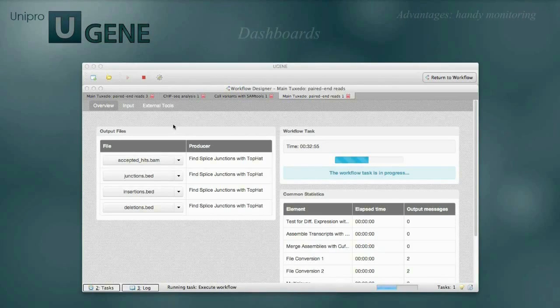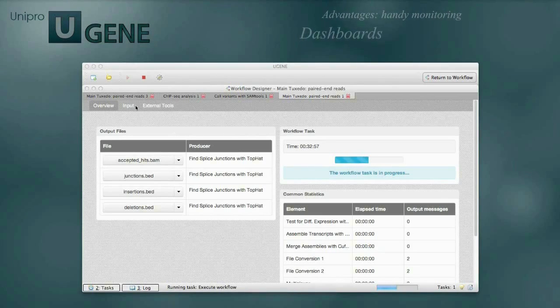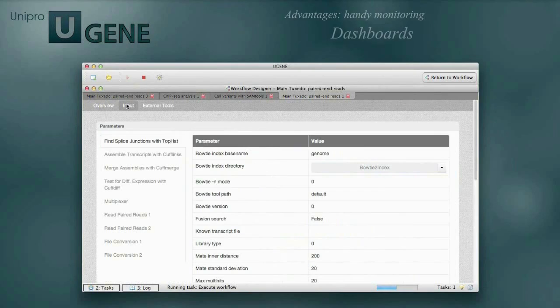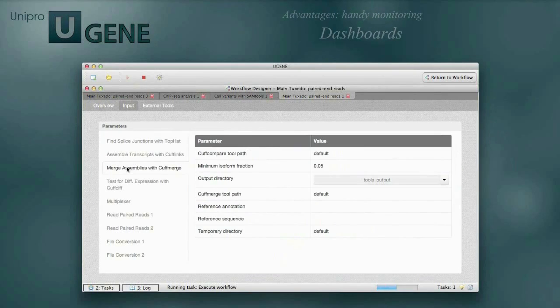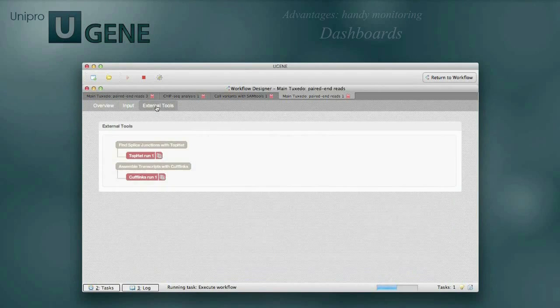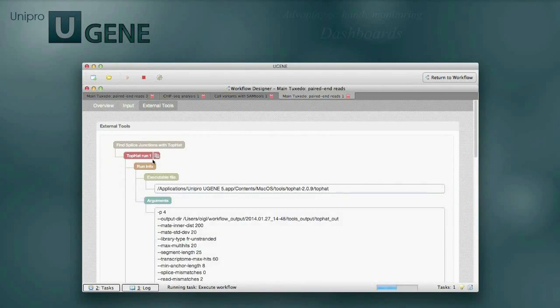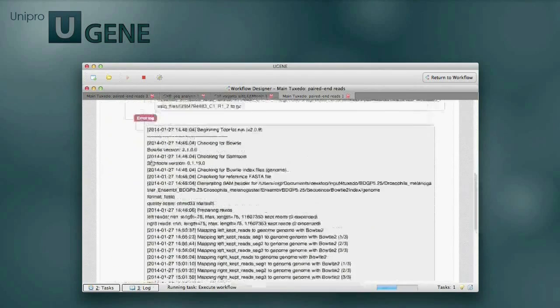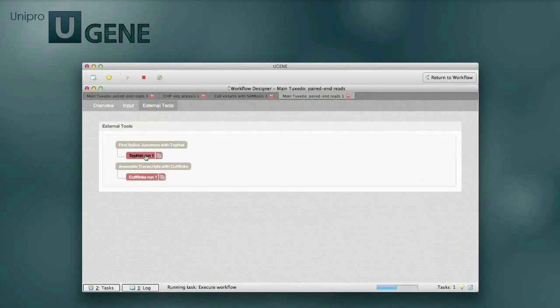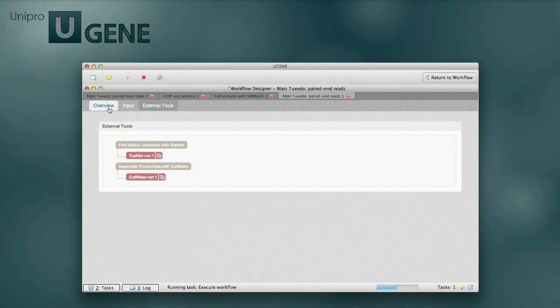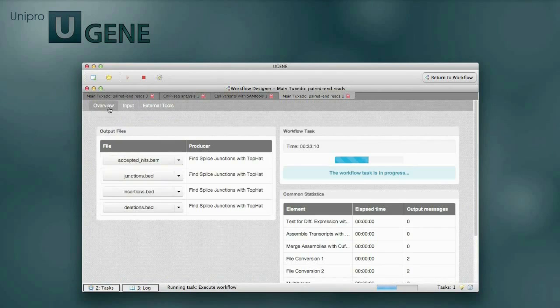After adjusting and running your workflow, you can monitor the calculation process using a dashboard. The dashboard provides information about the status of the running process, about the progress, produced files, and so on. Advanced users can see logs of the external tools in a special section of the dashboard.